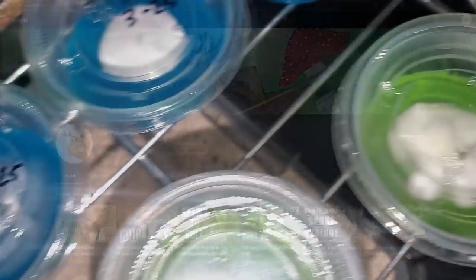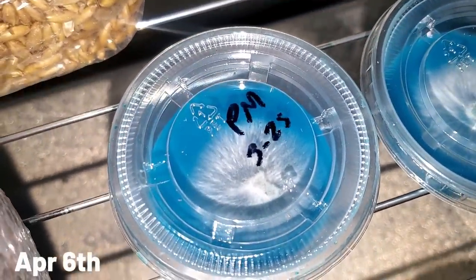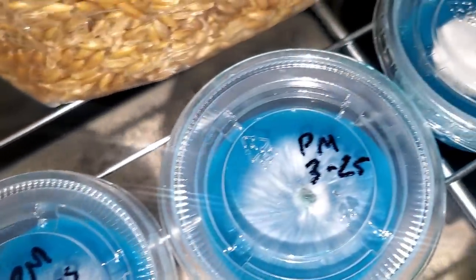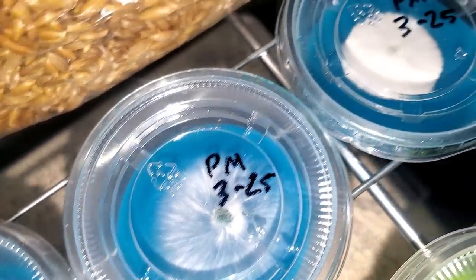It's now 12 days later, April 6th. Let's take a look at how the clones look. You can see the great mycelium growth that we're getting — everything's looking healthy and beautiful.